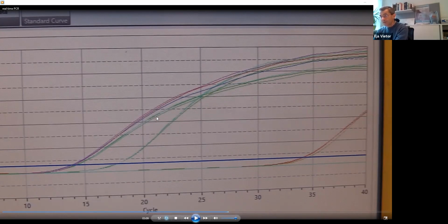So these 6 curves belong to the same gene, and that is the GAPDH. Naturally, the quality is good because you have seen already the readouts of the RNA concentration measurement, but it is also important to pipette properly, so they have to be almost all identical, these lines.